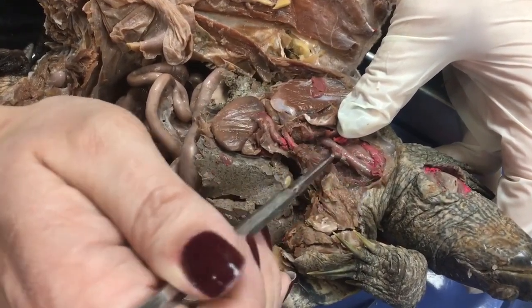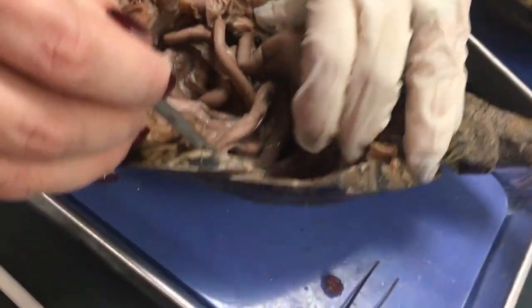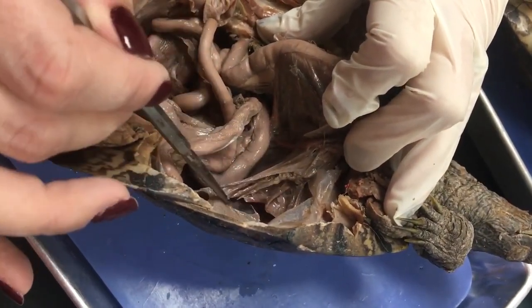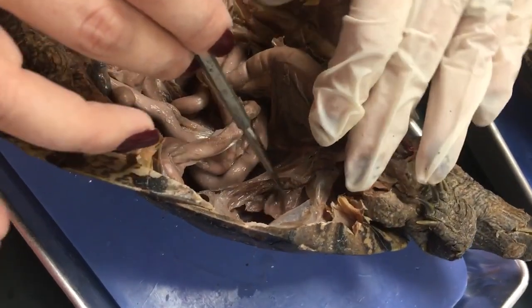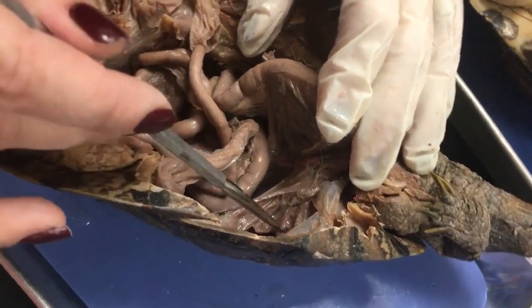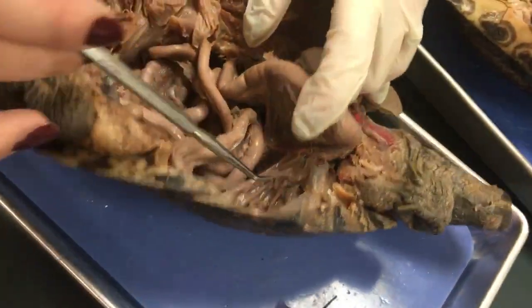So that just further directs air into the lungs. The lungs are located very, very far dorsal in the body cavity. We have a lung right here. And that is where we're going to have oxygen exchanged within some blood, within the capillaries inside of the lungs, and then carbon dioxide will be picked up by the alveoli in the lungs, and then will be expelled out of the body.